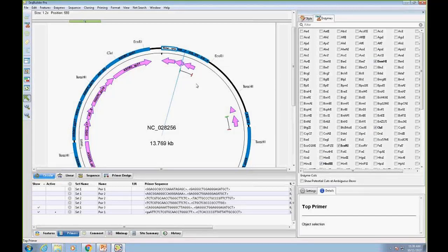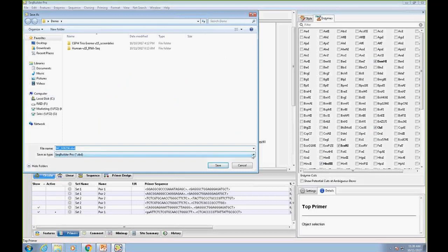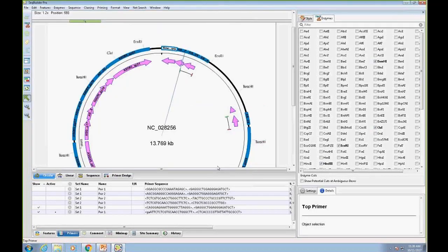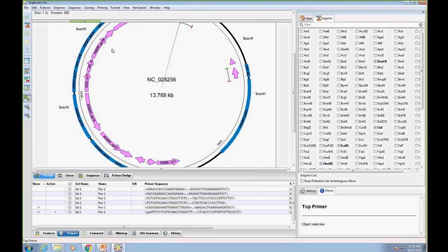When you save as a SeekBuilder document, all customized changes are preserved — the primers designed, feature style changes, enzymes, view states, and window positions are all saved within the document. This is distinct from the layout defaults, which control how unformatted sequences open.